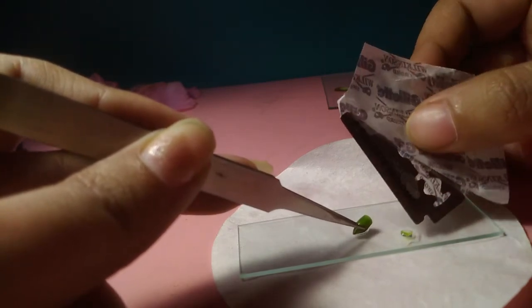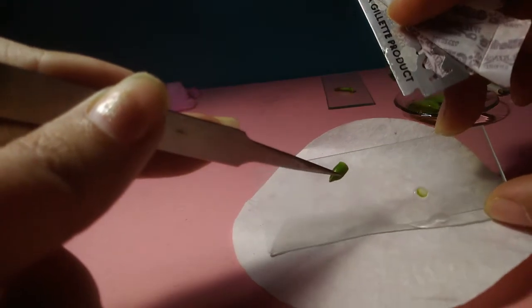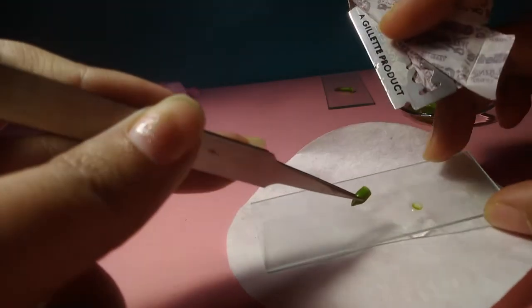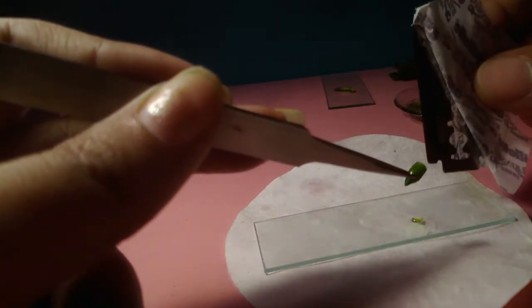If you want a longitudinal section, then you can cut it in a longitudinal way. I want a transverse section, so I have cut it like this. Now this is the TS of your ovary, which you can obtain simply from a flower bud by cutting at the bottom, at the base of the flower bud. Okay.